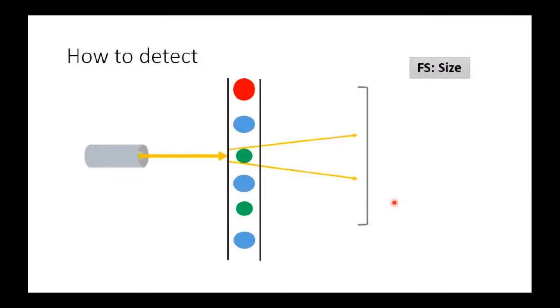Now the detector detects the pulse of photons, which is the forward scattered light. The detector, as I told you before, is connected to a PC, or a computer. The PC will convert the intensity of the light detected by the detector into voltage, and then I will get a specific amount of voltage for every cell passing through the laser beam.